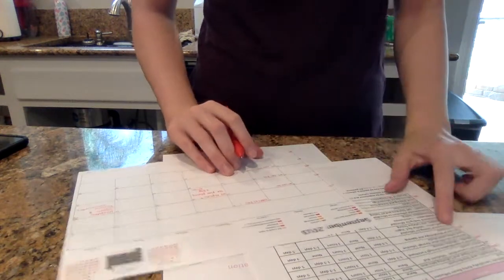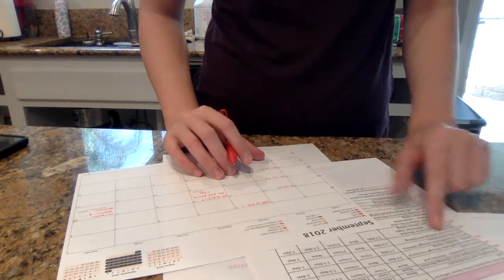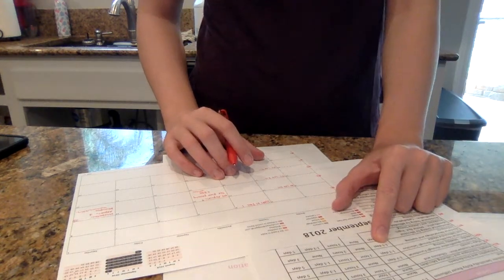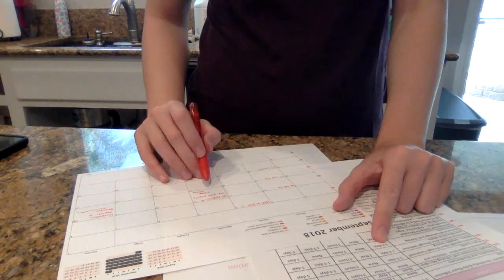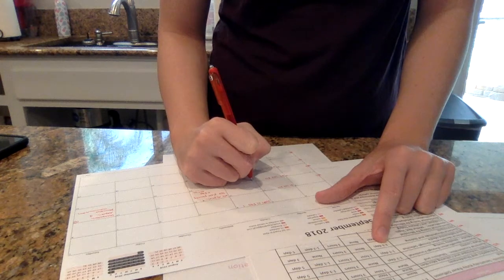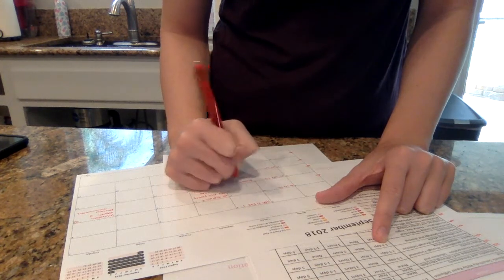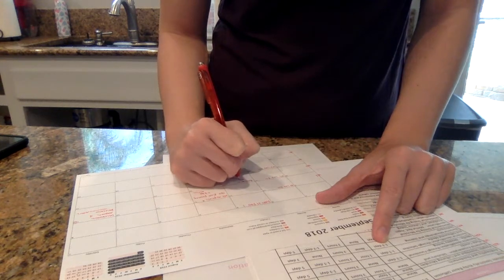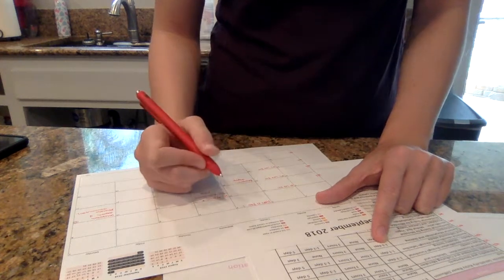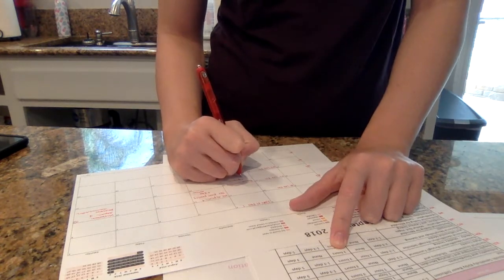Okay, for week 3, there's going to be a bacterial morphology and staining technique. It's 1 to 3 days with an active culture. So I am going to start on a Tuesday on this one. There's no plate pouring, and it's a 3 hour active time.